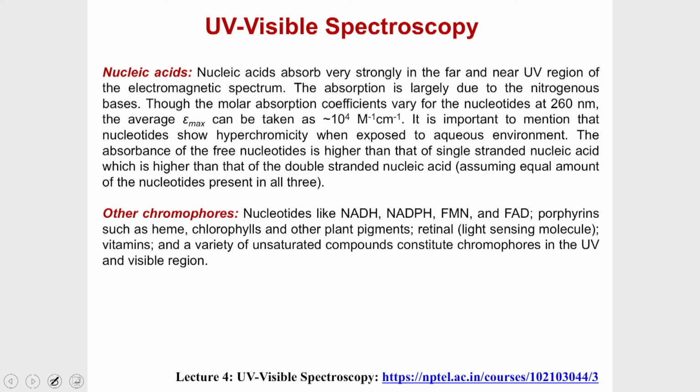Because the nucleotides show hyperchromicity, which means an increase in absorbance, that phenomenon is used to follow the unwinding of a DNA molecule, because once the DNA unwinds, the nucleotides get exposed to the water, and that is how they give you higher absorbance.